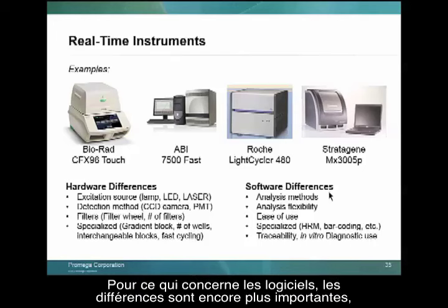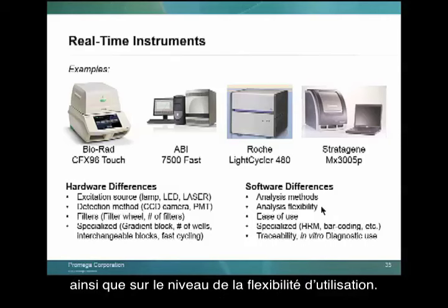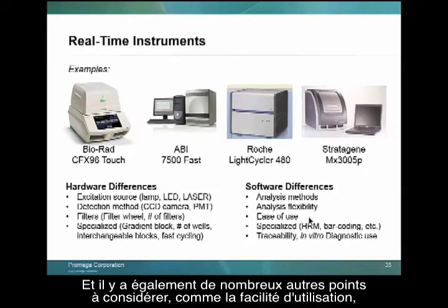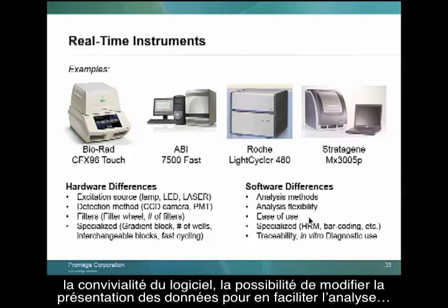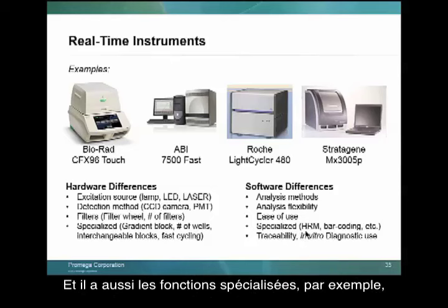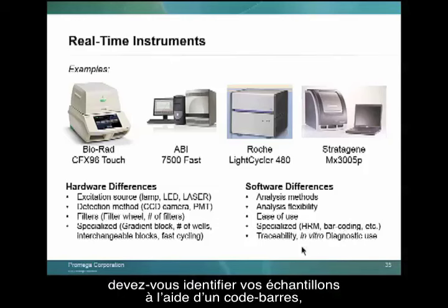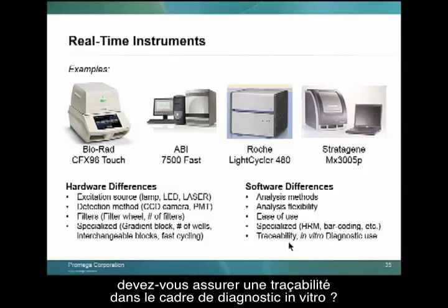Software, there are even more differences, especially with the algorithms and the analysis methods that are offered, as well as how much flexibility the user has. And there are a lot of ease of use considerations as well. How user-friendly is the software? How easy is it to manipulate the data to make it most easy for you to present? Can you use it on your desktop computer? Do you have to do all the analysis at the instrument? And in addition, there are some specialized features. Like, do you want to genotype by HRM? Do you need to barcode your samples? Do you need traceability for IVD use?